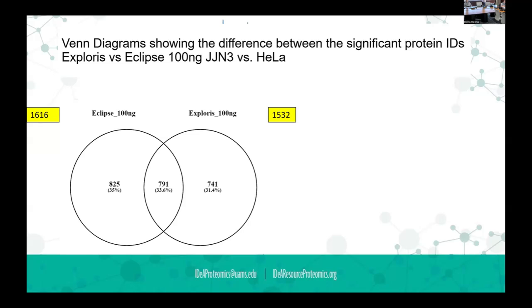I don't have answers. I just did the experiment, and it may be that the way I searched the data or did the experiment or something. Well, this is also why I try to tell people who want to compare experiments months later to run everything together and not as separate experiments. Right, get the same platform, all those technical differences.